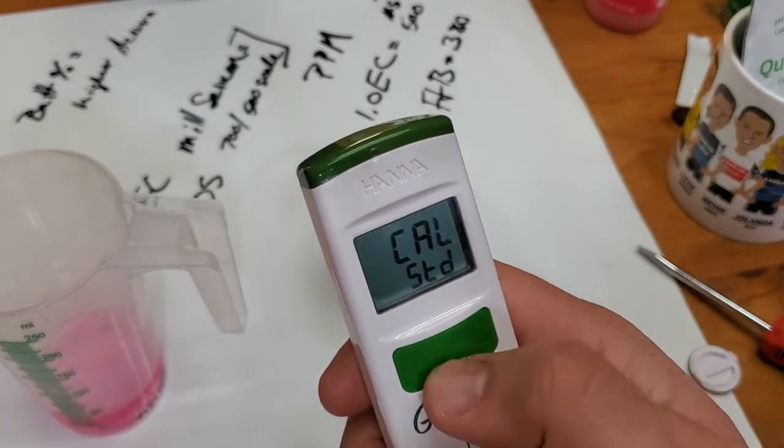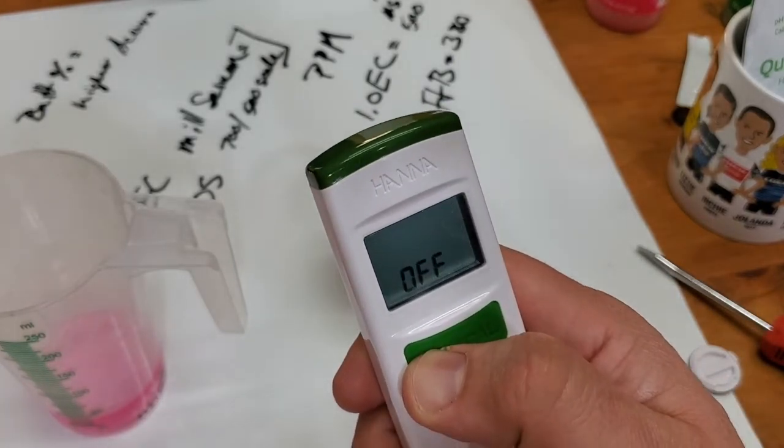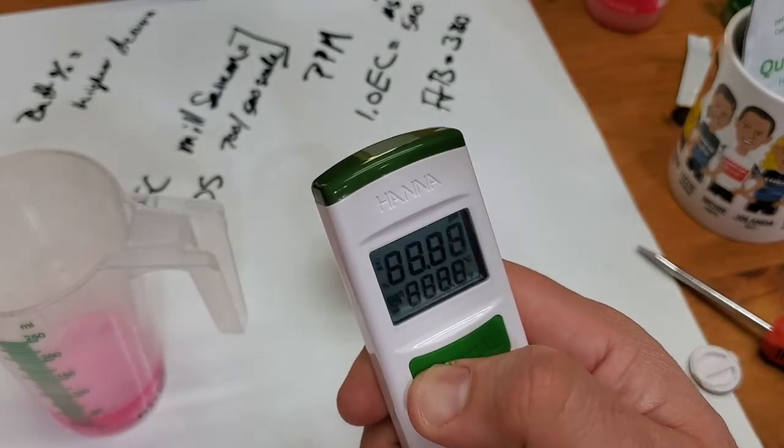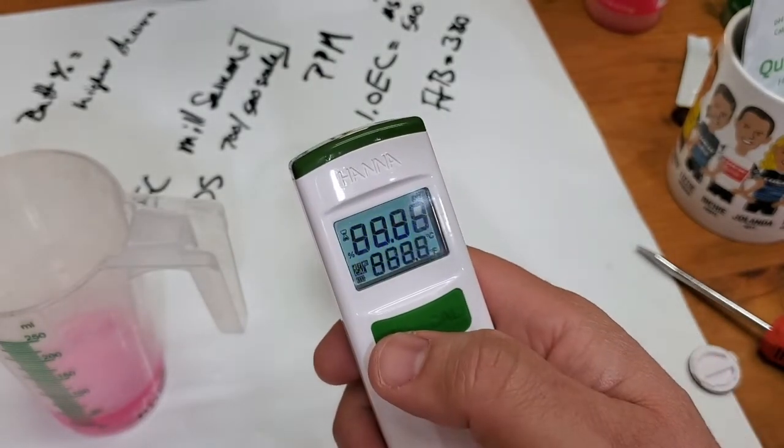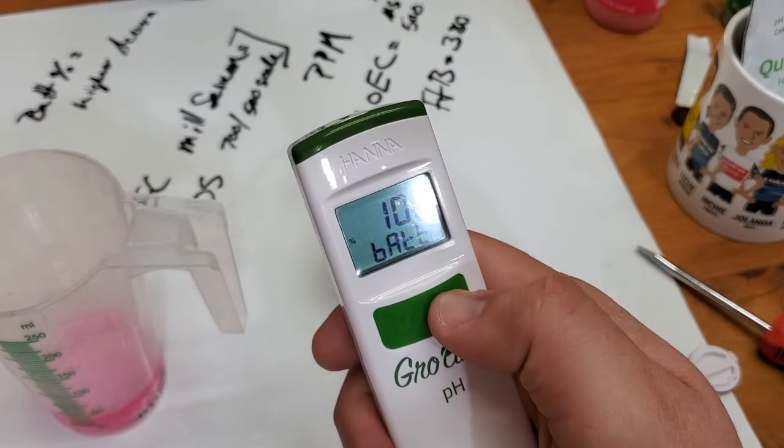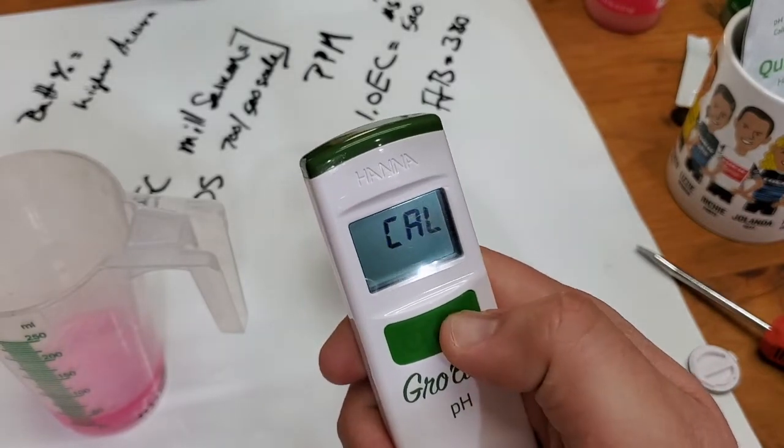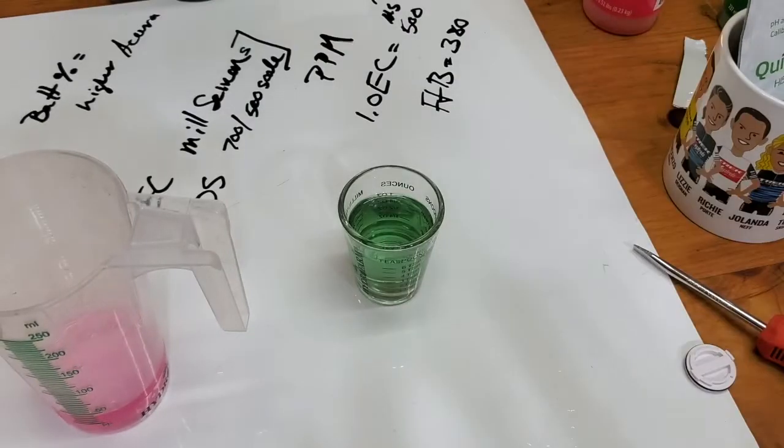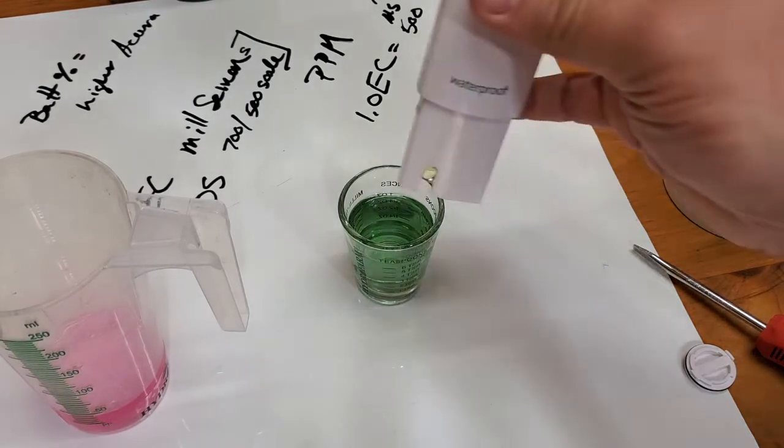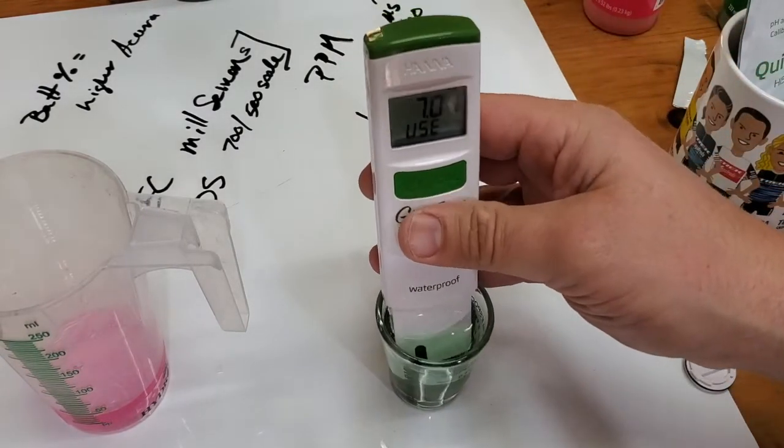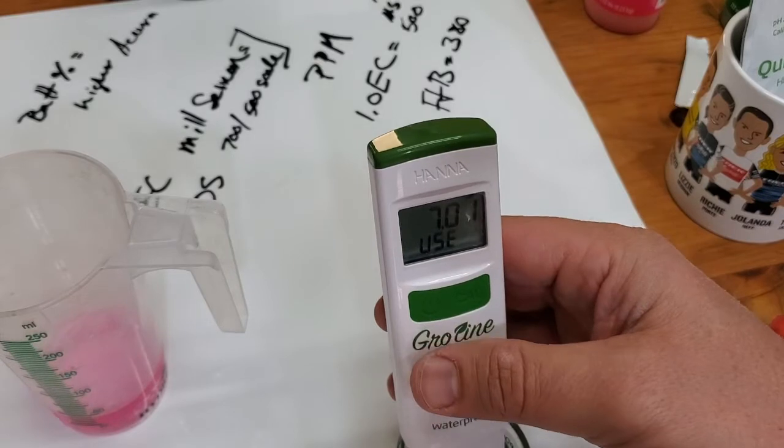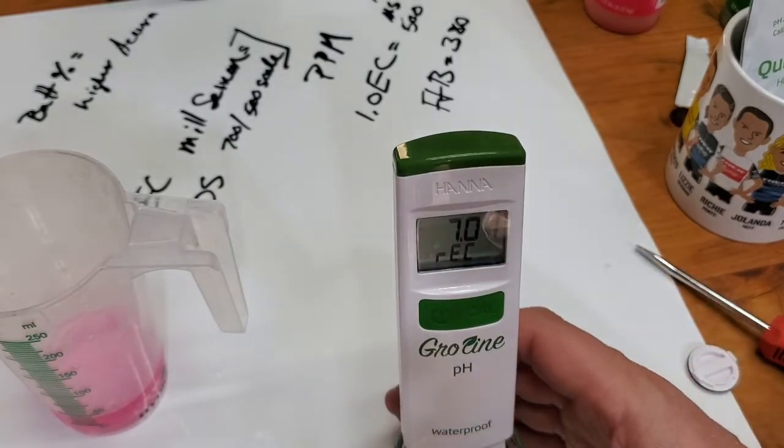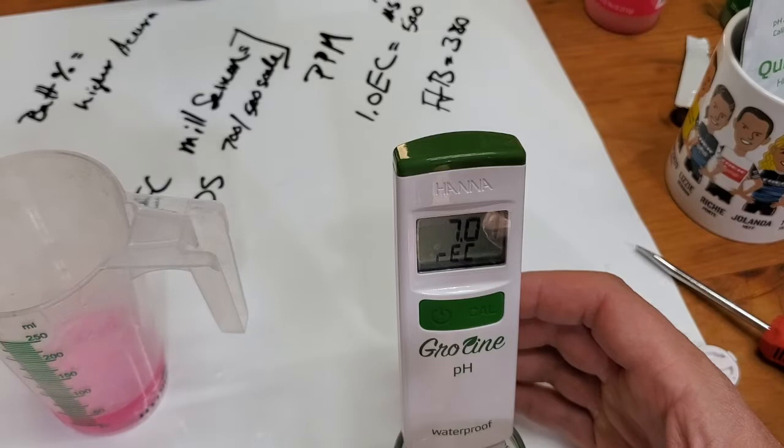We want to calibrate it, so we hold down the calibration. It tells me to go into 7.0. There's a 7.0, so it's recording that.